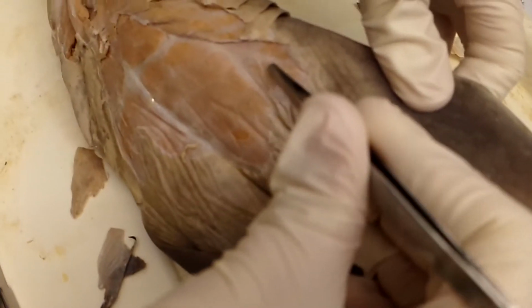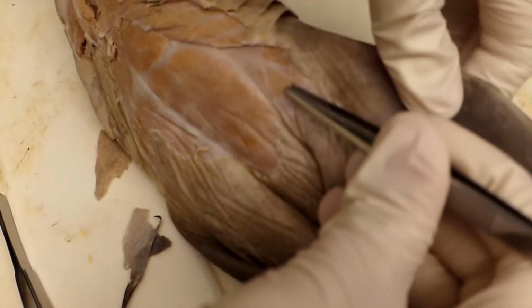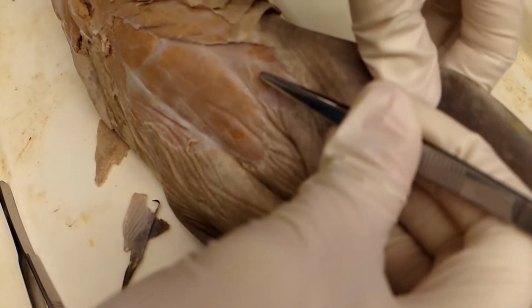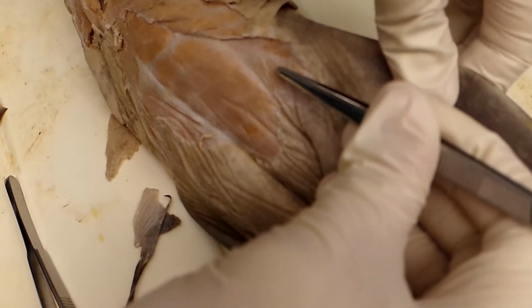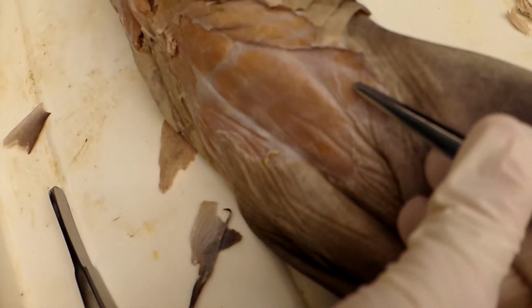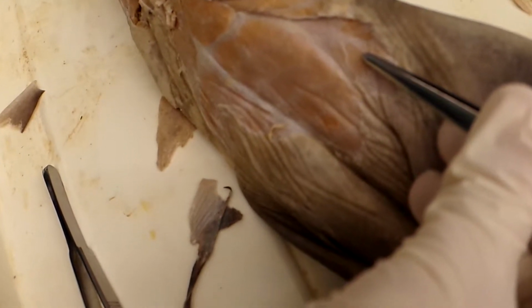Then we have the pectoral adductor or flexors here, which originate from the coracoid bar of the pectoral girdle and insert in the pterygiophores, which are homologous to the pectoralis, the coracobrachialis, the humeroantebrachialis, and the forearm flexors.